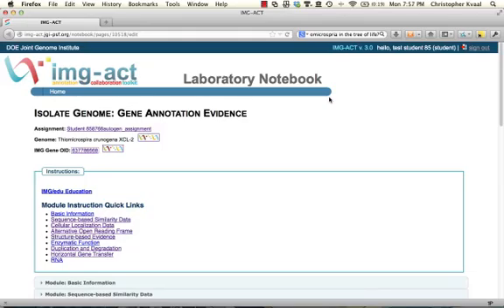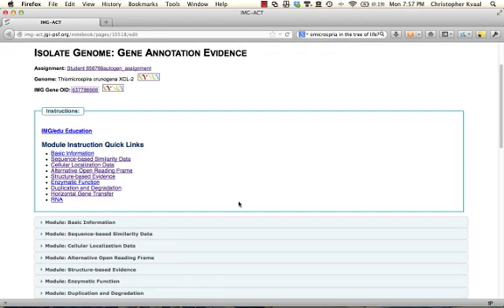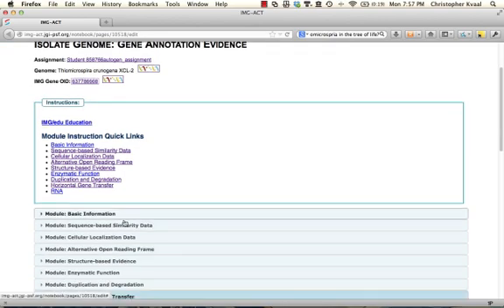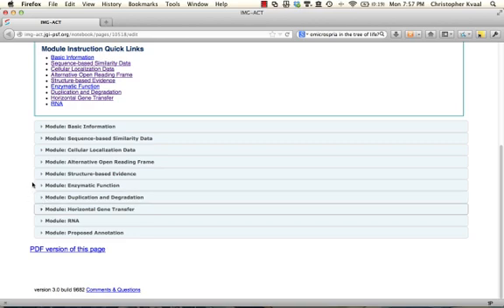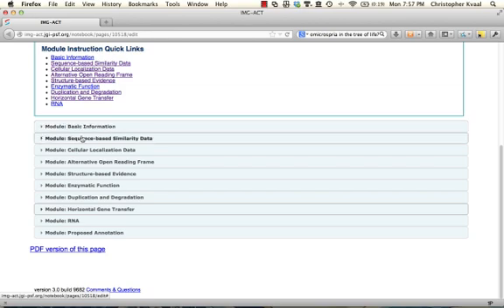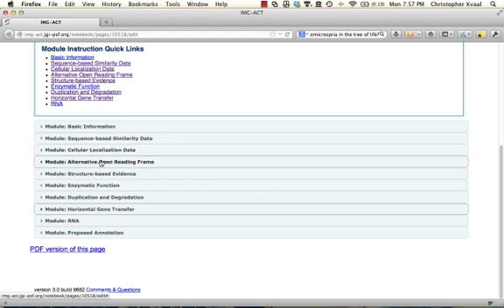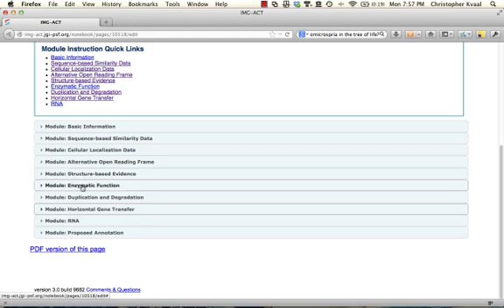This screencast demonstrates the horizontal gene transfer module of IMGACT. As a quick review: basic information, sequence-based similarity data, cellular localization data, alternative open reading frame data, and structure-based evidence have all been completed. We're skipping enzymatic function and duplication and degradation.